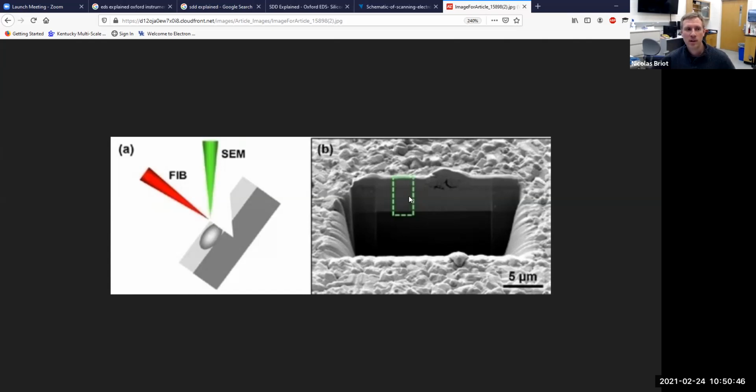So hopefully, if the silver-rich region is only a few microns, we'll be able to see that by preparing the sample that way. That would be the plan going forward, because we know we have silver at the surface, but how deep is the question? From what we've done today, it's not 50 microns deep, but it's at least a few hundred nanometers or microns deep.